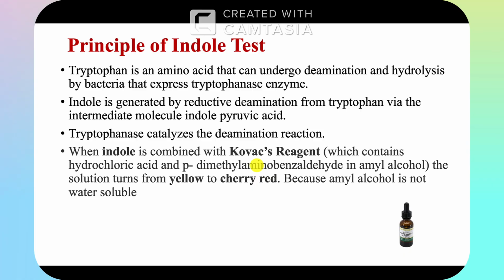As I said, the main principle of the indole test: tryptophan is an amino acid that can undergo deamination and hydrolysis by bacteria that express the tryptophanase enzyme.